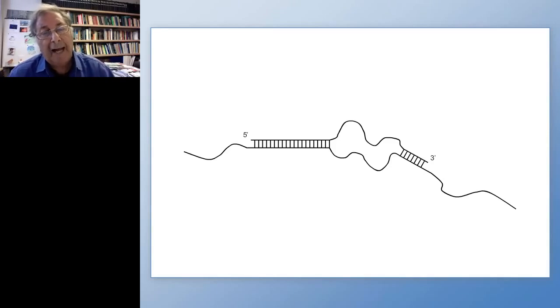So you have two factors determining whether an amplicon gets made. One is the relative abundance of perfectly complementary hybrids compared to mismatched hybrids with wild type that occur at equilibrium during the annealing stage. But the second is because the perfectly complementary hybrids persist for a longer time in milliseconds than the weaker mismatched hybrids with the wild type, their probability of encountering and binding to a DNA polymerase is higher. So it's the combination of both probabilities, of how abundant they are and how long they exist, that determines the great selectivity of these primers.